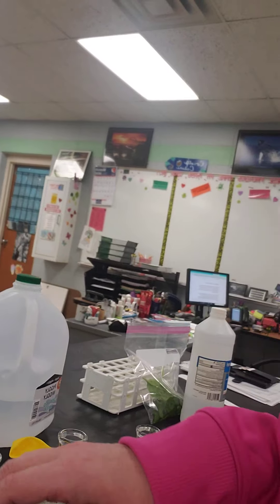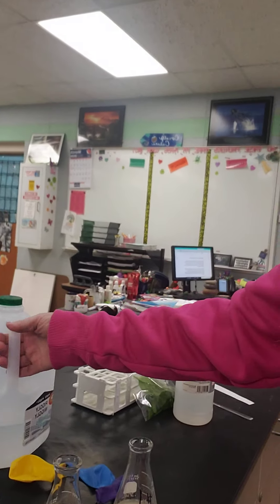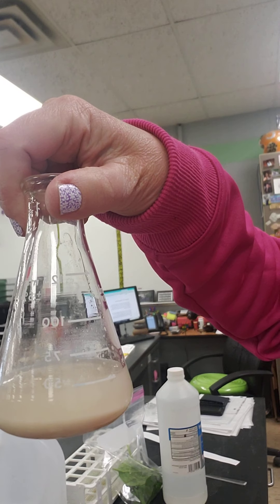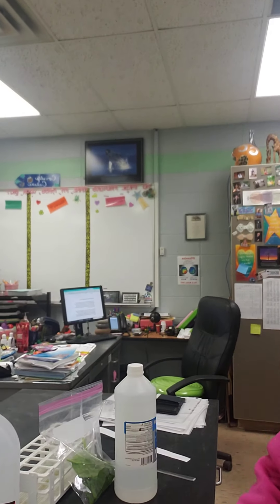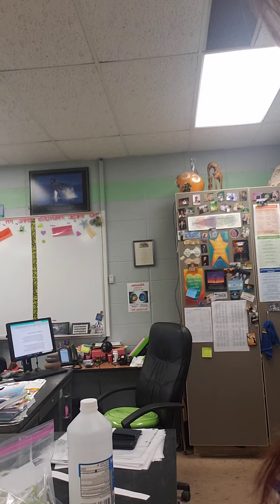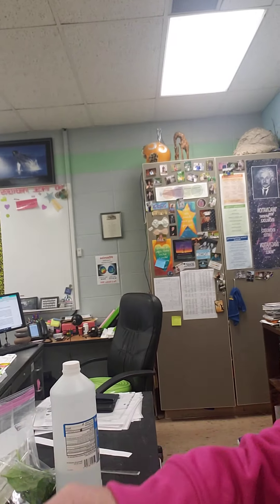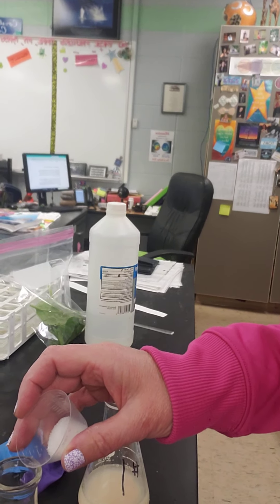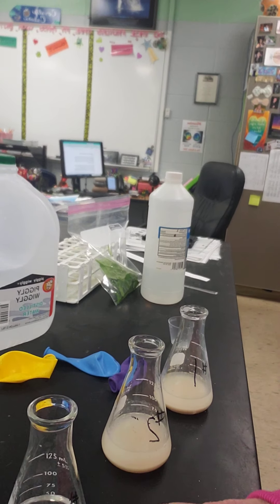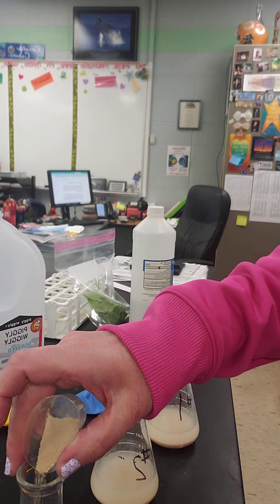Flask one has two grams of yeast, 50 milliliters of distilled water, and two grams of sugar. Into flask two, I put in two grams of yeast and 50 milliliters of water — now I have to put in the two grams of sugar. Flask three is only going to get two grams of yeast and 50 milliliters of water. That one's going to be my control.